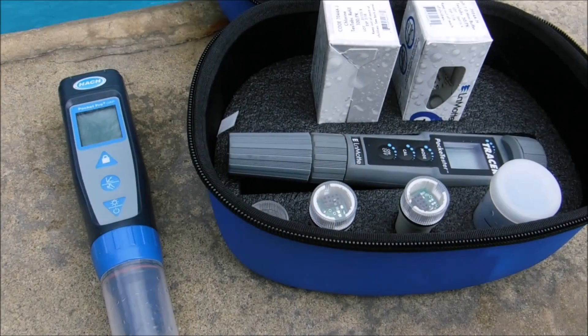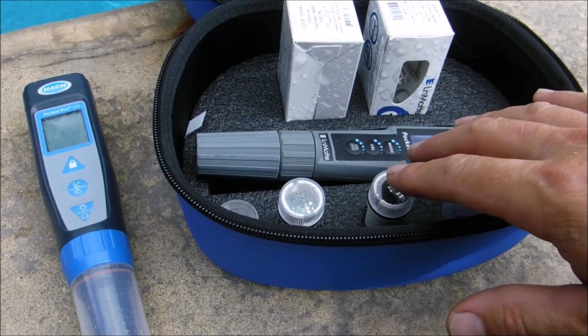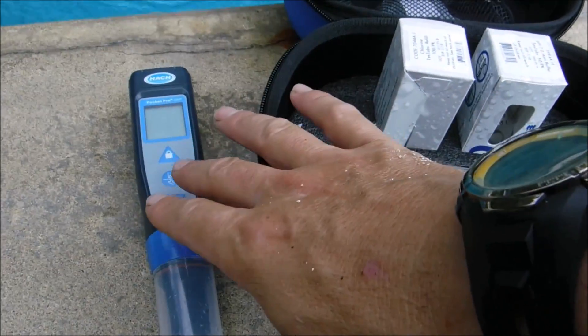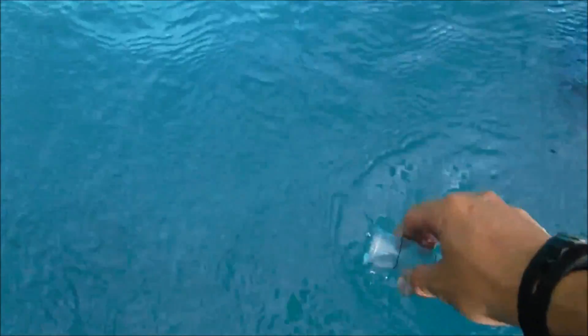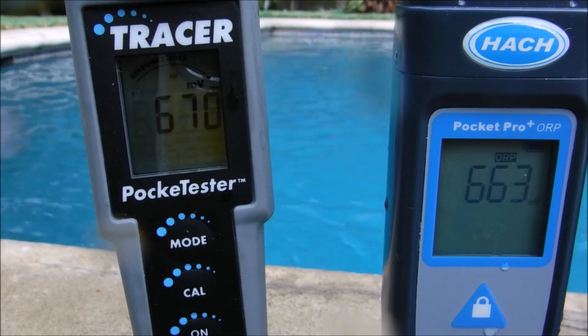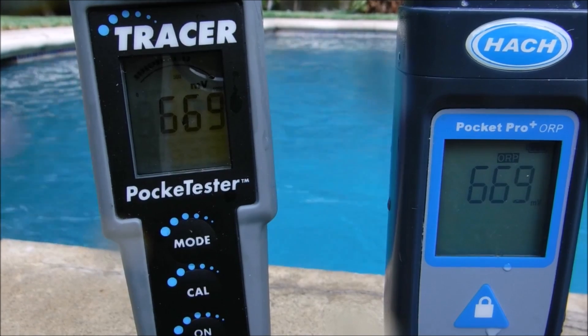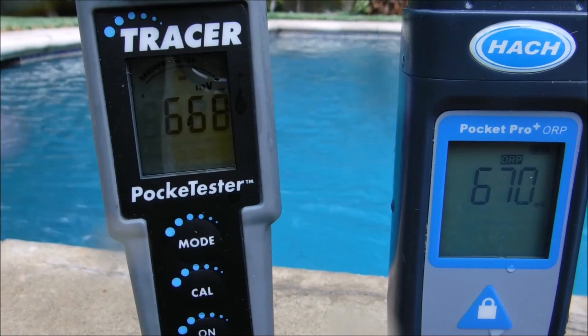I'm going to go ahead and get the ORP at this pool. I'm using the Tracer total chlorine ORP and pH kit, as well as the Hach Pocket Pro Plus ORP. I'll get a water sample to use for both testers. You can see they're both in the 660–670 range. The numbers will keep moving — ORP is not an exact number but a range — and you can see these are in a pretty good range.